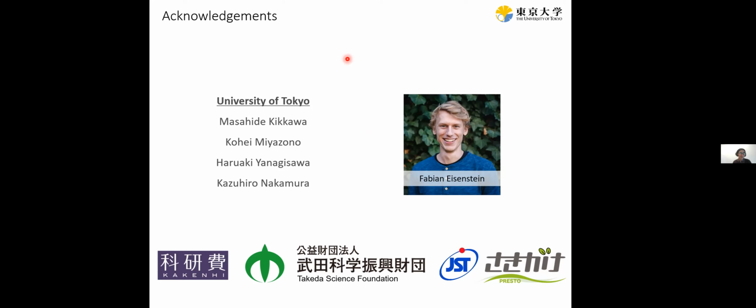So Yufeng Zhao has a question. He says, I missed the step about pre-washing the grids with acetone before glow discharge. What is the purpose of this step?